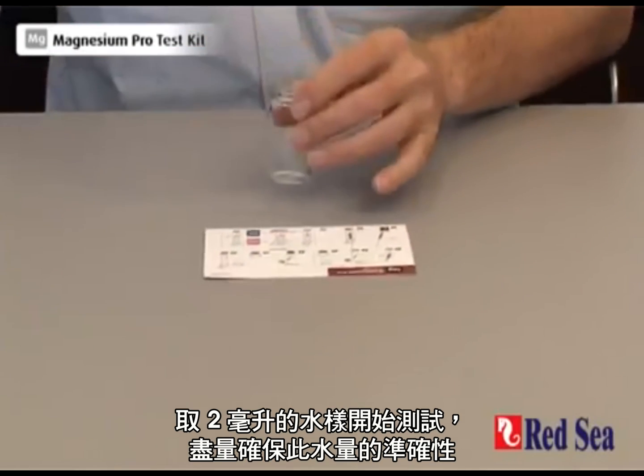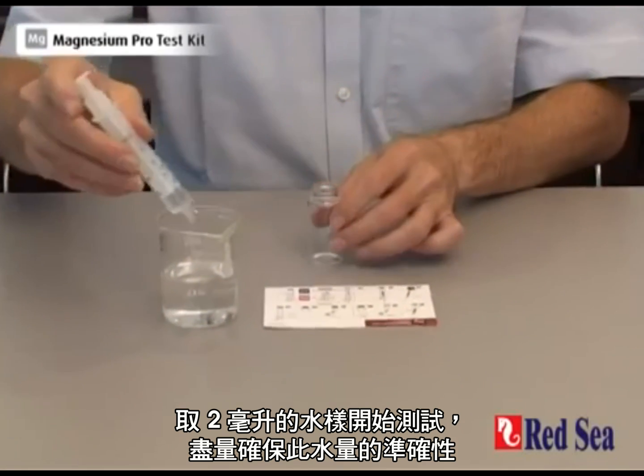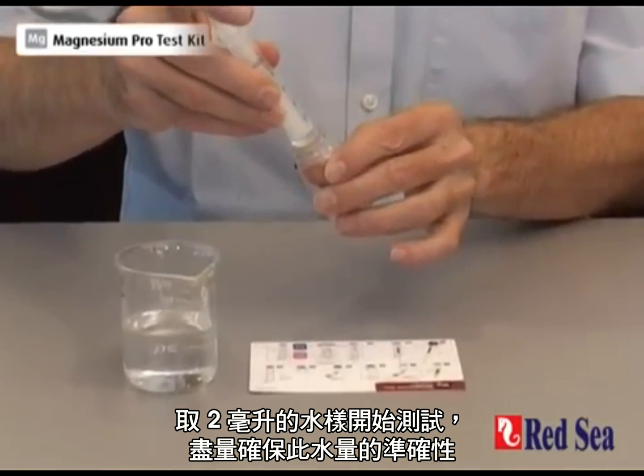We start the test by taking a 2ml sample of the water. Try and be as accurate as possible with the 2ml.